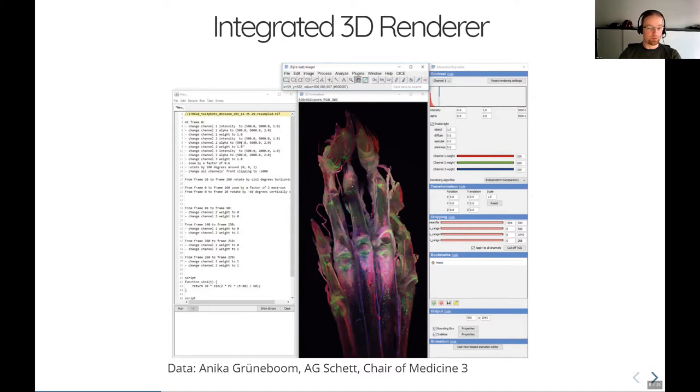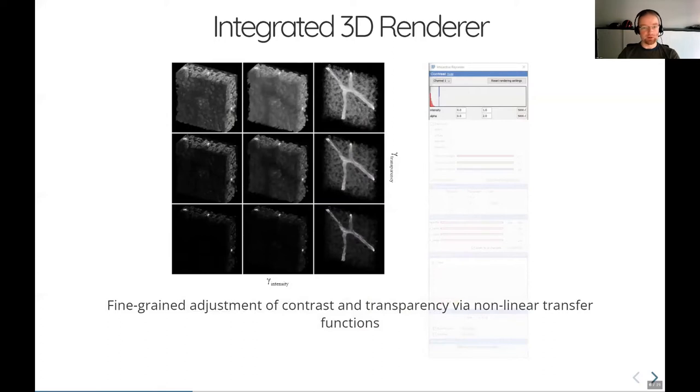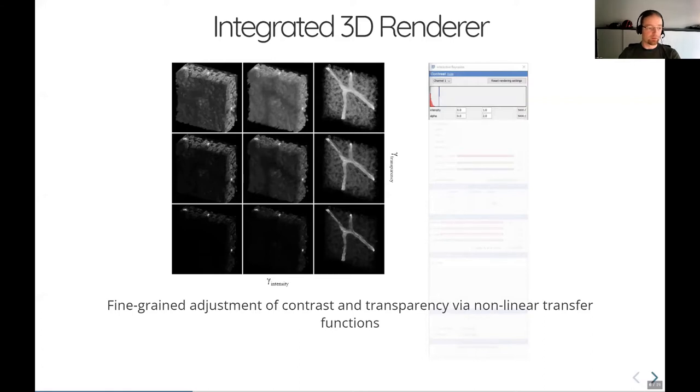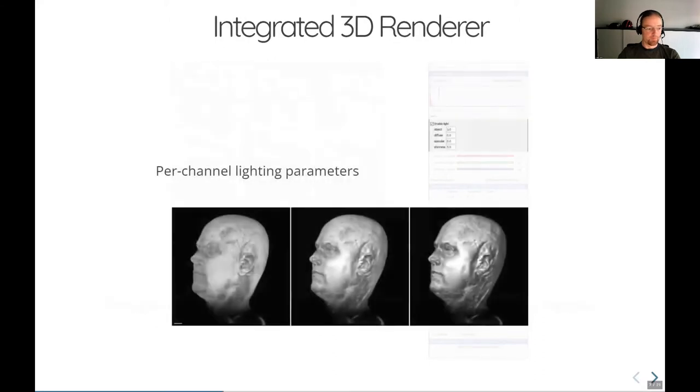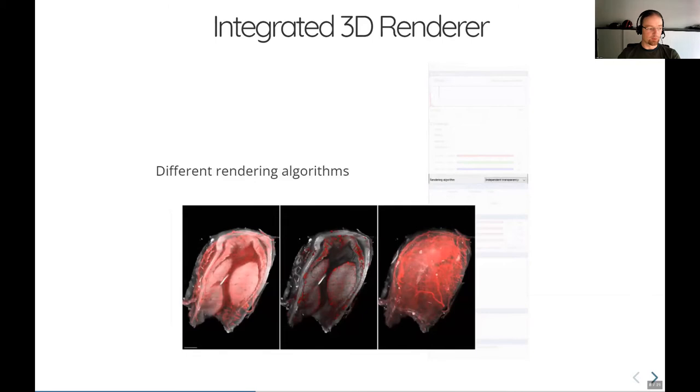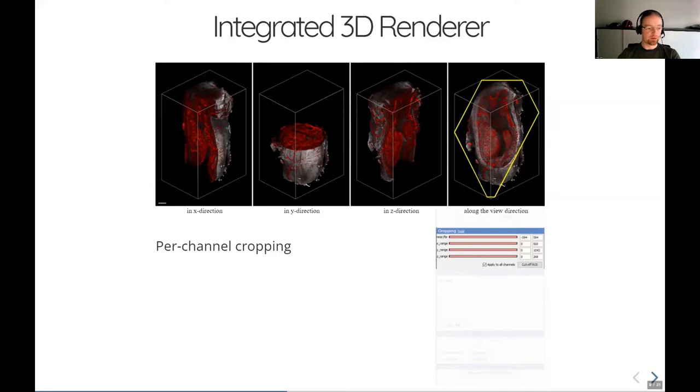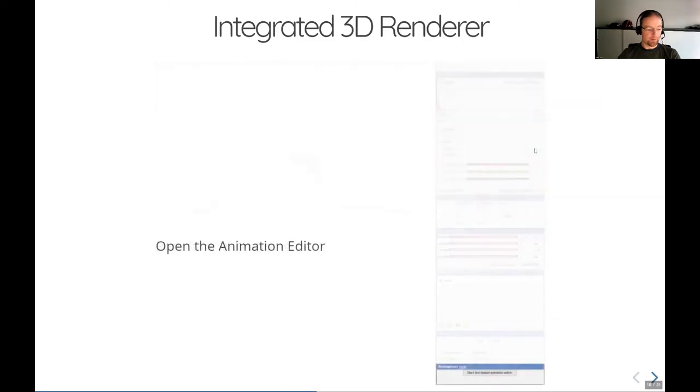So let's quickly look into 3D script's features. 3D script offers fine grained adjustment of contrast and transparency via nonlinear transfer function, which affects significantly what the output will actually look like, as you can see in this image here. Now just quickly, we can have lighting parameters per channel, which give the output a surface-y appearance. 3D script has different rendering algorithms. We can crop each channel individually in all three axes from two different sides and also along the viewing direction, as you can see in this last slide panel.